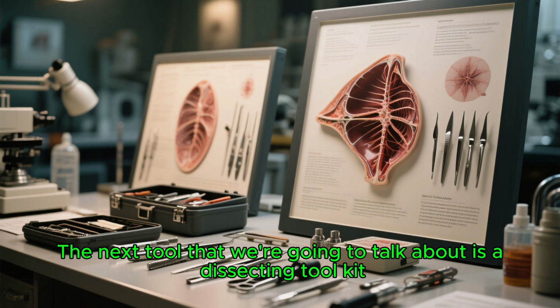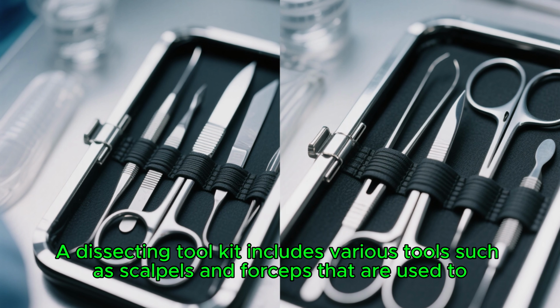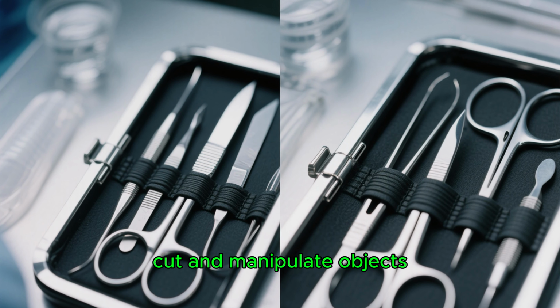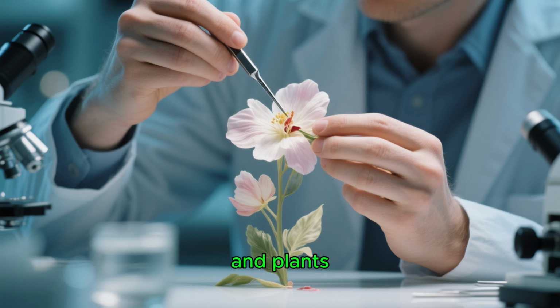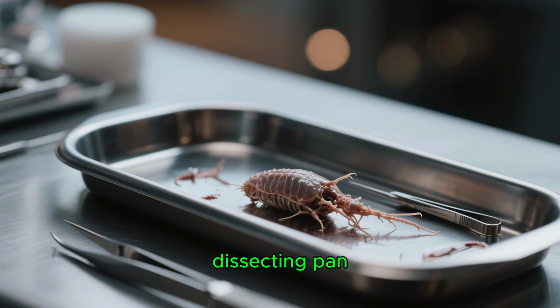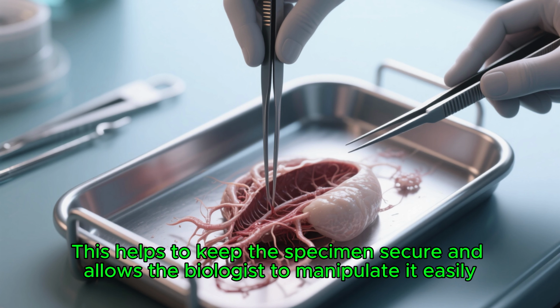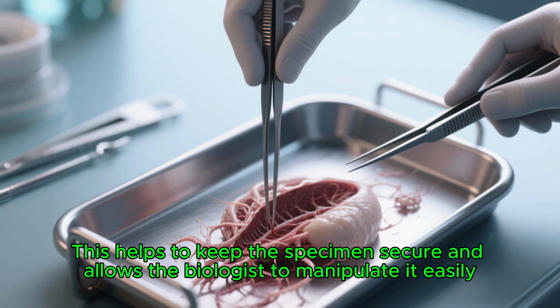The next tool that we're going to talk about is a dissecting tool kit. A dissecting tool kit includes various tools such as scalpels and forceps that are used to cut and manipulate objects. It's especially helpful for dissecting animals and plants. The next tool that we're going to talk about is a dissecting pan. A dissecting pan is a tray that is used to hold a specimen while it's being dissected. This helps to keep the specimen secure and allows the biologist to manipulate it easily.